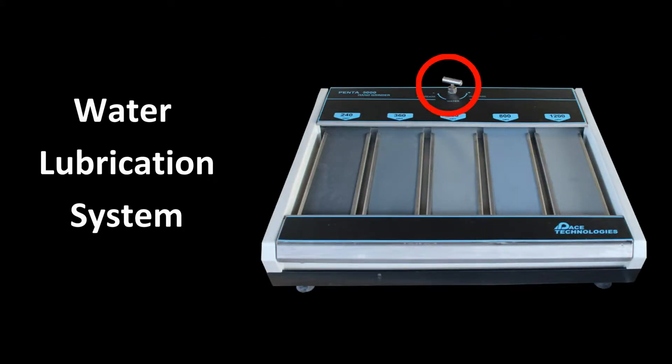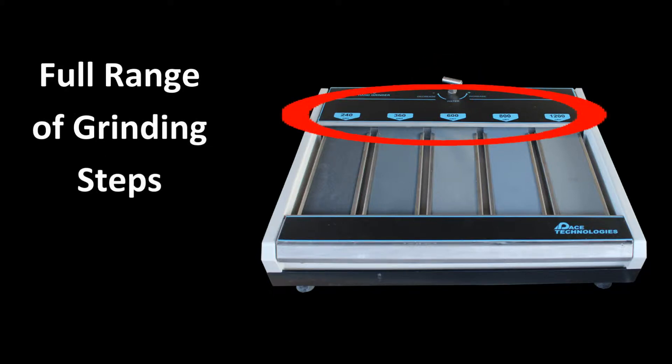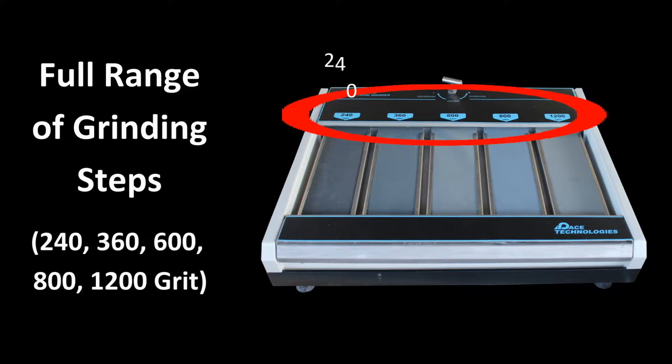With a water control valve, both wet and dry grinding can be accomplished. The Penta 5000 provides intermediate grinding with 240, 360, and 600 grit silicon carbide, and fine grinding with 800 and 1200 grit silicon carbide.